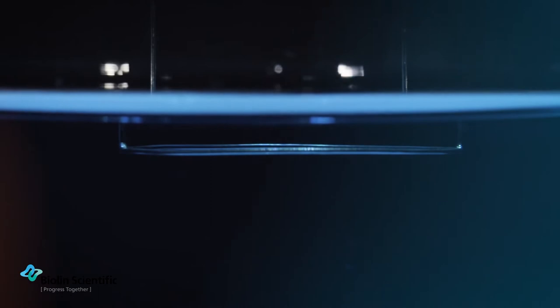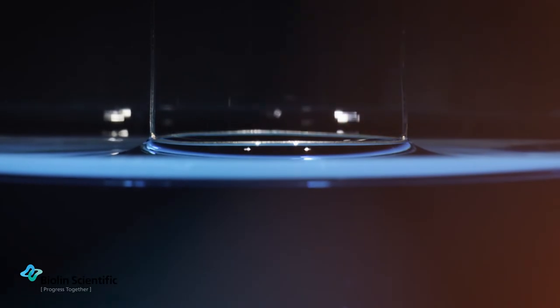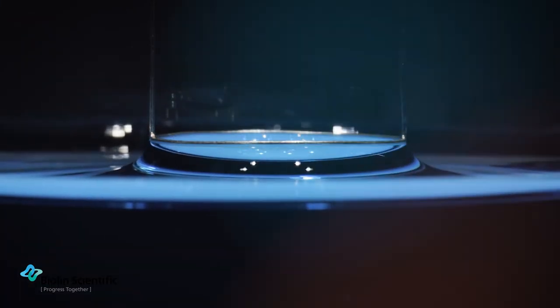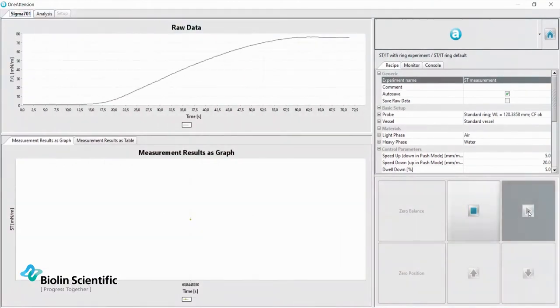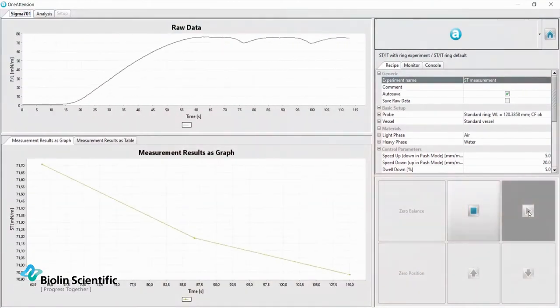The fully automated measurement starts by the probe being immersed in the studied liquid. The system automatically detects the surface position and after wetting the probe starts approaching the surface gently with the help of an extremely precise lift.